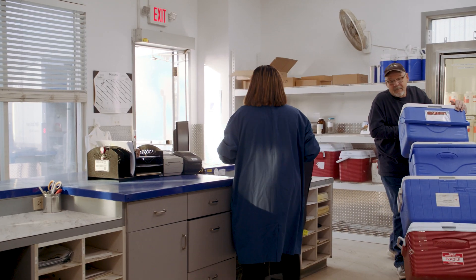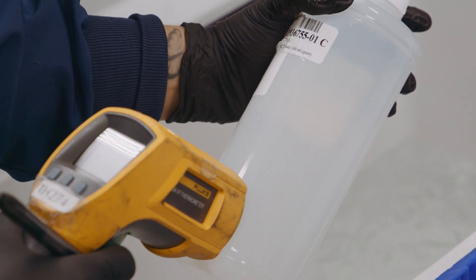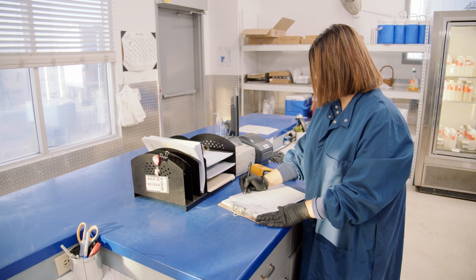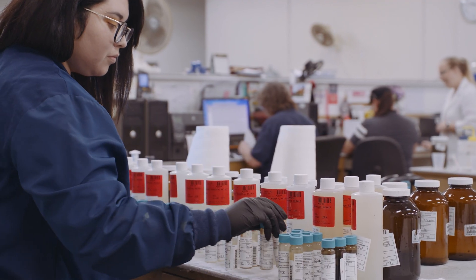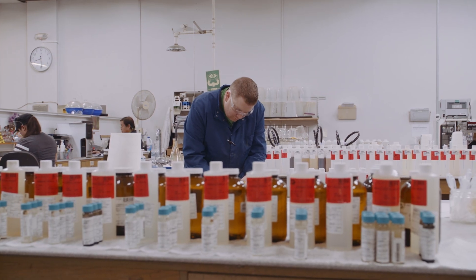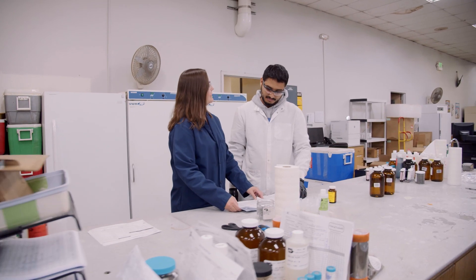All samples start at our sample receiving, where they are first inspected for safe and proper sample transport protocols, such as temperature and time in transport. Next, they are logged into our comprehensive laboratory information management system, or LIMS, based upon chain of custody directives our clients provide with the samples.